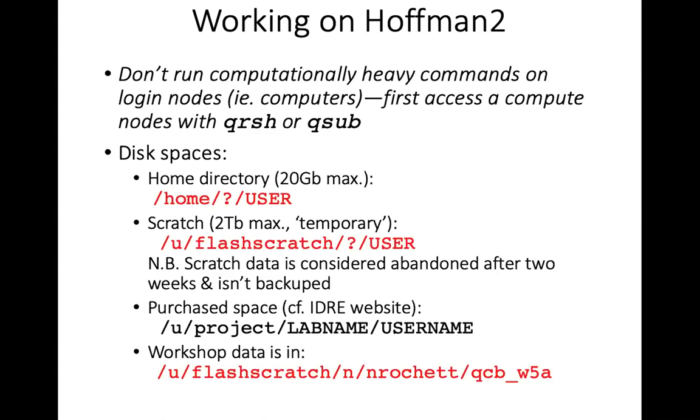The other way you have is you copy the address to the clipboard. So usually it's like right-click and then copy link address. And then you paste this in, while you're connected to the cluster, and you do wget on the cluster, and it's going to download that from that address directly to the cluster. That's usually a bit shorter. But yeah, you always have the two options. Whichever is more comfortable and easy for you.